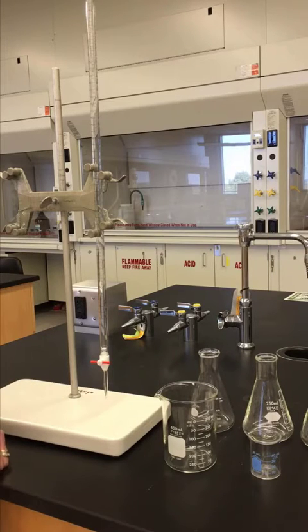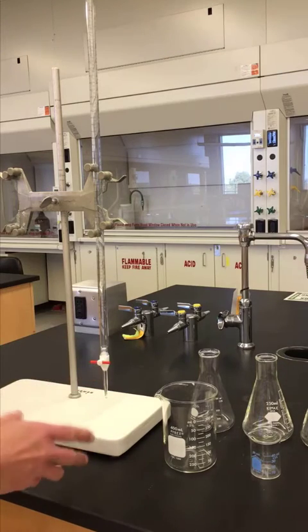Today we're going to be doing a titration, and so some of the equipment that you need for a titration are here.